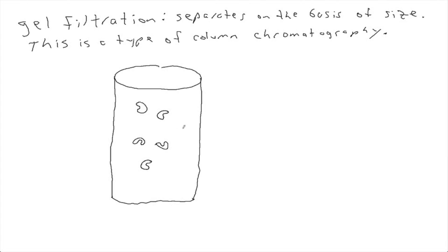So does the sample start on the top or the bottom? Top. And who will emerge first, the larger or the smaller proteins?